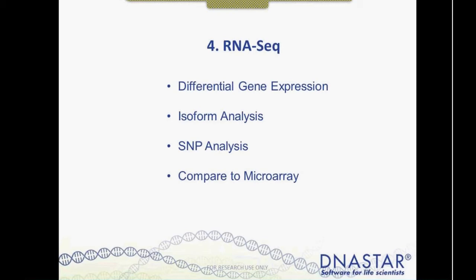The workflow is similar to how we set up, say, a gene panel. We align our sequence data to a reference genome. We can look at the assembly in SeqMan, and we can do the gene expression and compare the different sets in ArrayStar. This particular data set is with three different cow species, and so it's possible to look for differential gene expression.